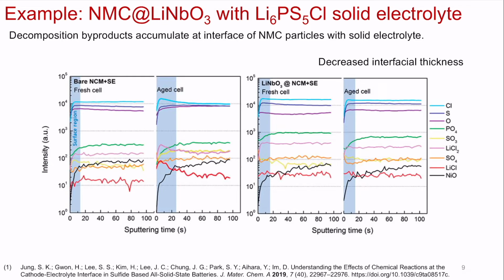Yes. But with the coated, it takes you a while before you start observing it, which makes sense because the coating creates a protective layer. Yes, okay. So it takes you slightly longer for the fresh. So you see the difference is minimal, is minor.